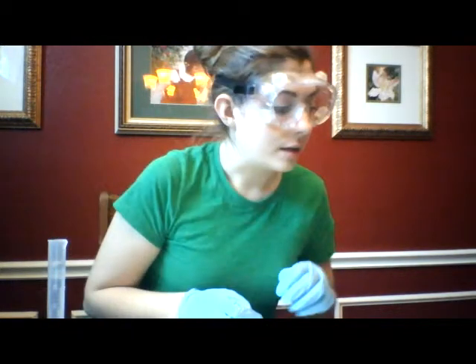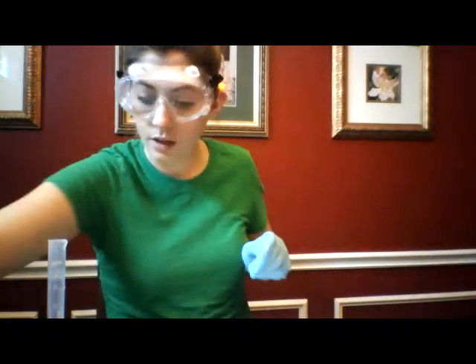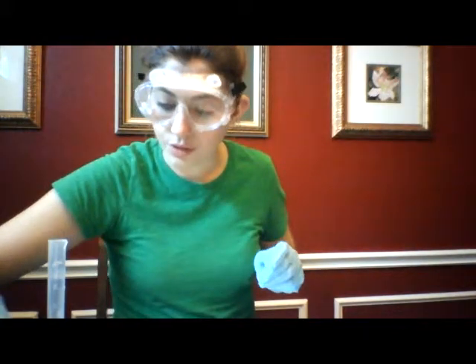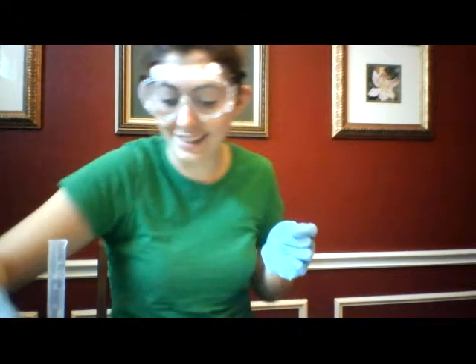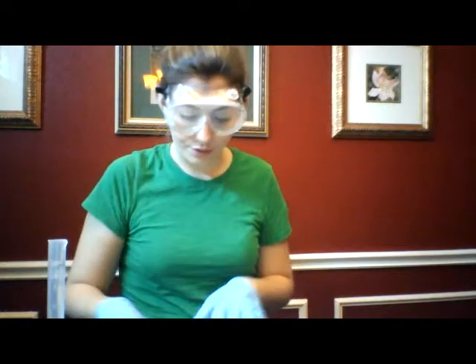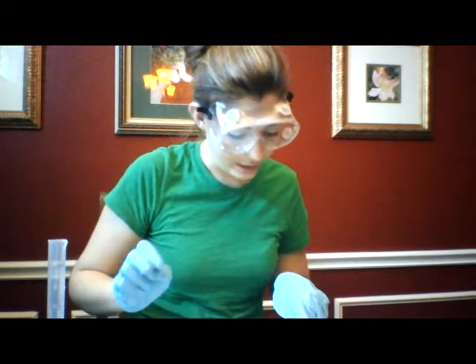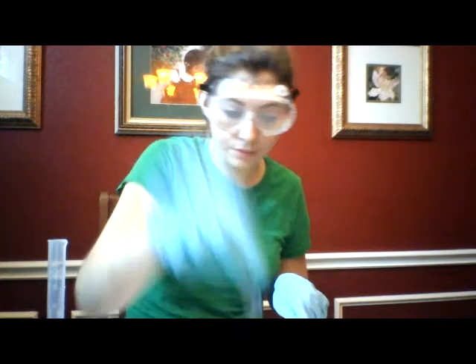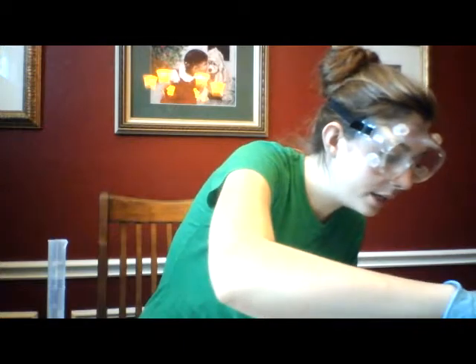So we have all our solutions over there. We're going to be using the Qualitative Anion test bag from Lab Pack. In addition, we're going to be using the lead acetate strips. Okay, so first thing we're going to do, we're going to put 8 drops of the anion in a test tube. So the first one we're going to be testing is bromide.